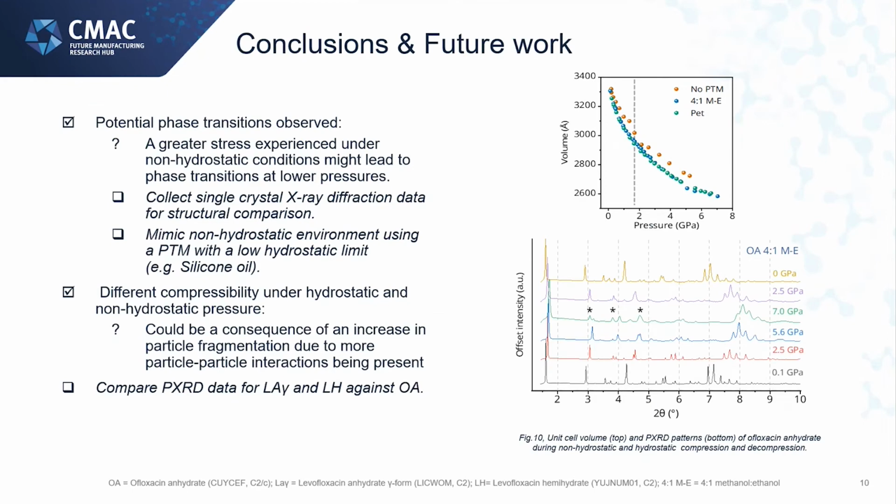So overall, the conclusion is that we saw some potential phase transitions. It's also interesting to see that when using non-hydrostatic pressure, this potential phase transition is at a lower pressure, which could be because there's a greater stress experienced by the particles, as there are a lot of direct particle-particle interactions. So in order to verify whether these are happening, we are now collecting single crystal X-ray diffraction data for structural comparison, and to see whether we also see these potential phase transitions.